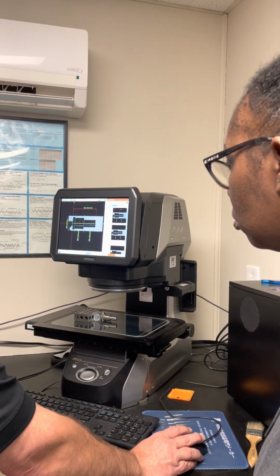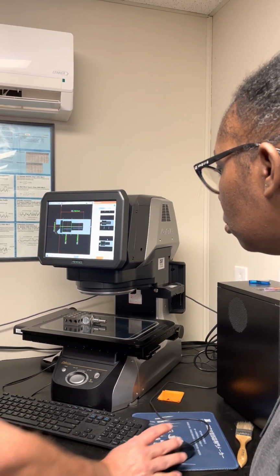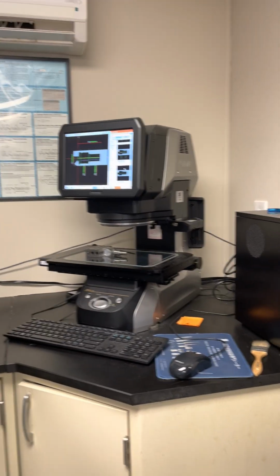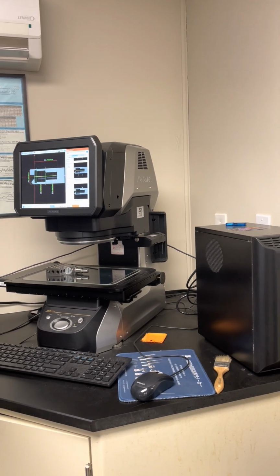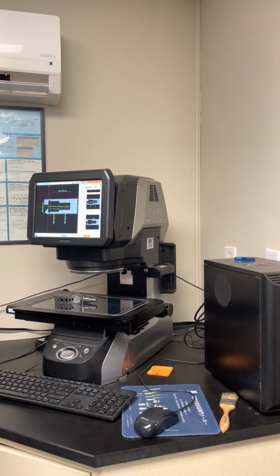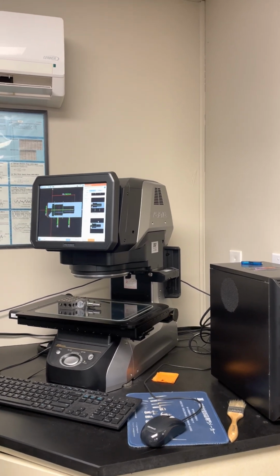So you notice we only have the 2 layers. While you can have a good number of layers, the more layers you have, the more time it takes to focus up and down for all of them. So I like to look at the part and say, this is one focus, this is another focus, this is one lighting, this is another lighting, and try to put it all together.